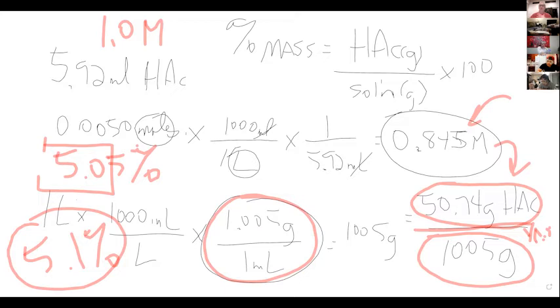So don't worry if the solution looks a little darker than we thought it was going to. I'm absolutely certain that's because our volumes are so small that it's going to be an intense color. As long as the color you see is because of one additional drop, there's really nothing you can do about that.